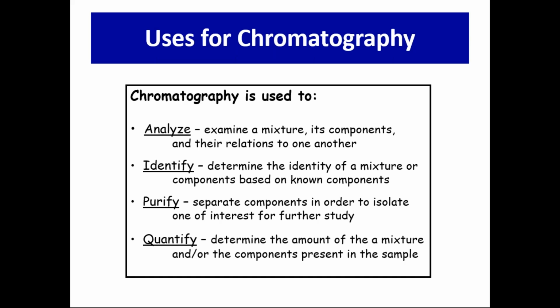They are also used to purify. When we do the overexpression of proteins such as insulin and antibodies, they need to be purified, and they are all purified by a technique called chromatography, so that you get pure insulin or the pure antibody that you require. Chromatography can also be used to quantify the amount of an analyte or a chemical in a mixture. So chromatography is a versatile technique, as you will see, and you can also use different types of media.